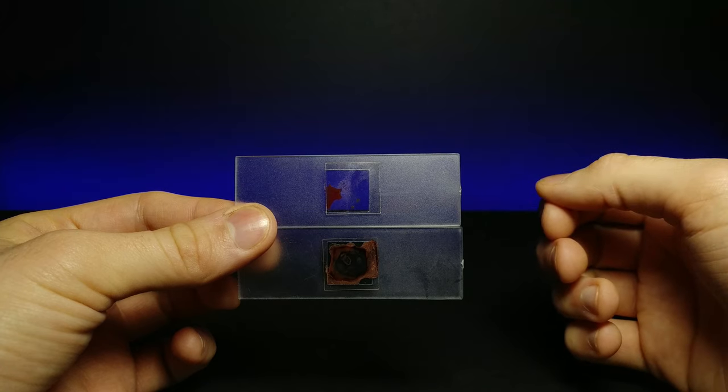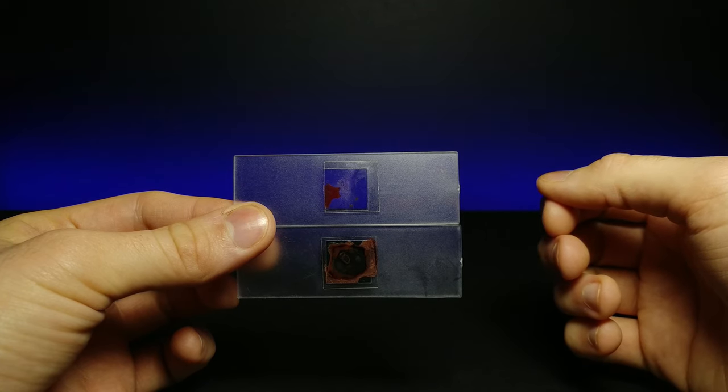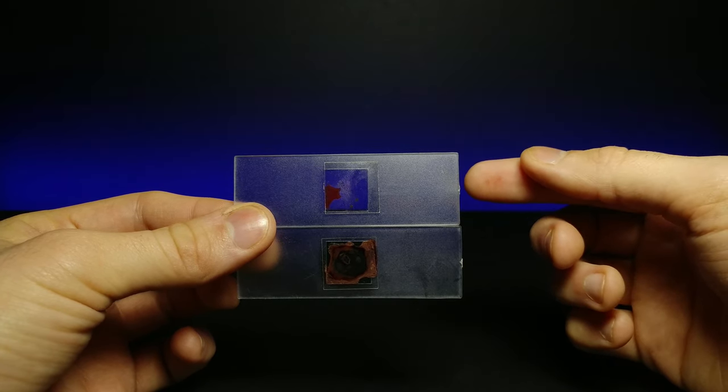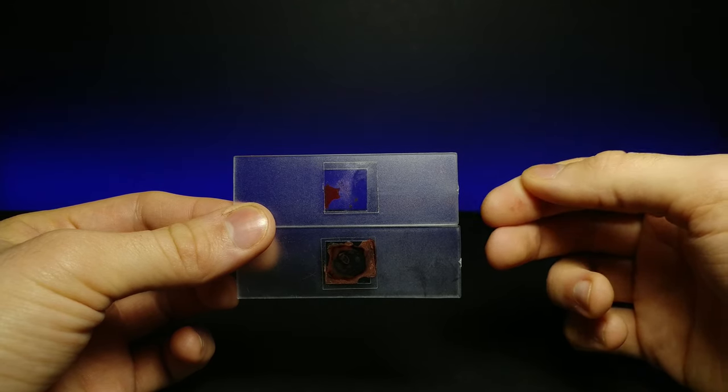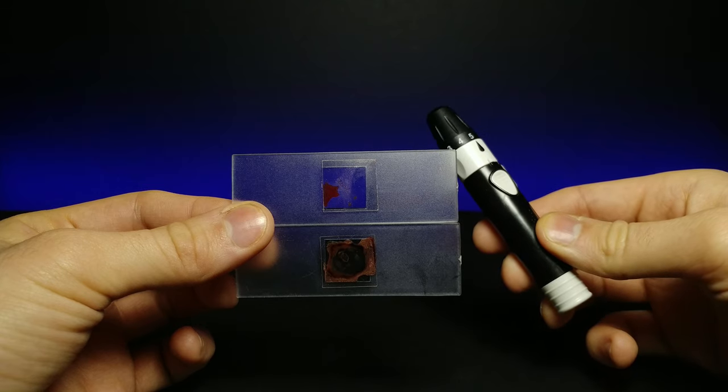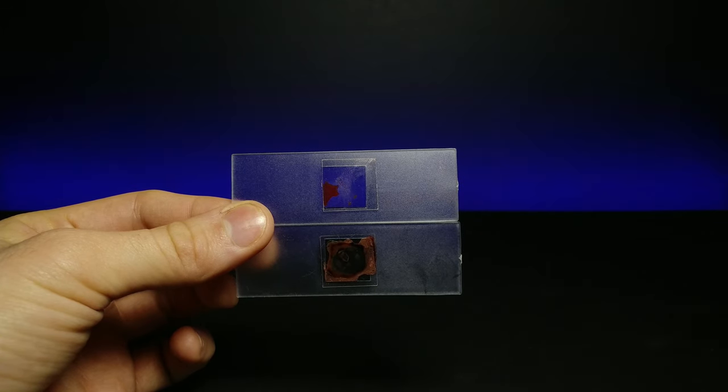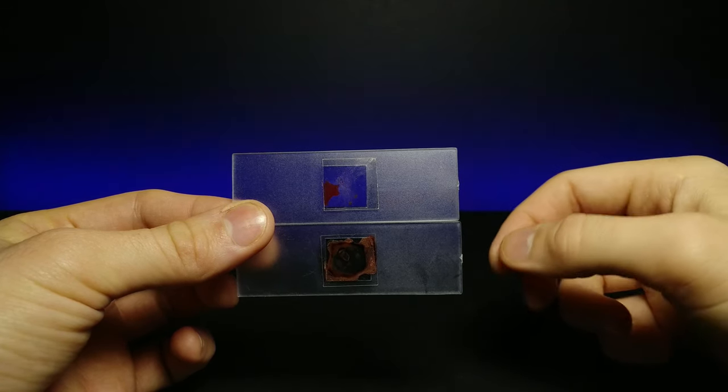How's it going guys and welcome to a JHR microscope review. We're going to be looking at the difference between live human blood and dried human blood. These were both taken from me using my diabetic poker, which I use on a daily basis, so it's not really a big deal for me. We're going to put this under a microscope that is hooked up with a camera directly to my PC so you guys can see this really up close.